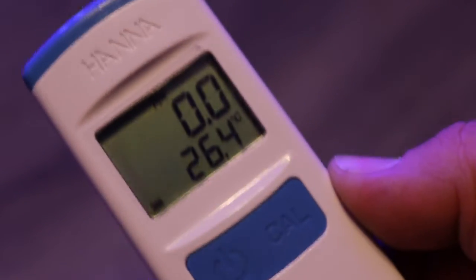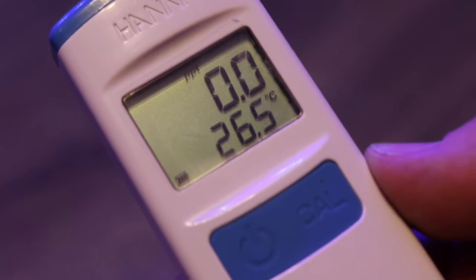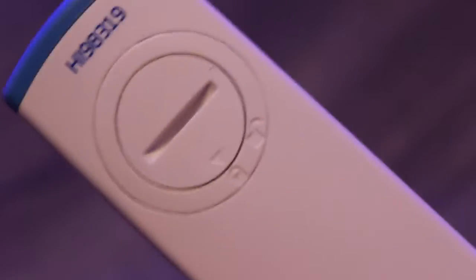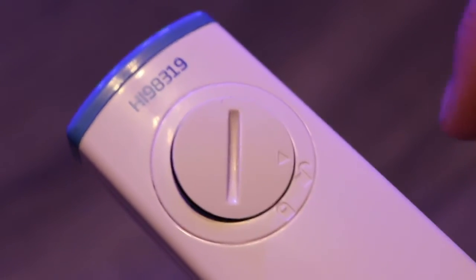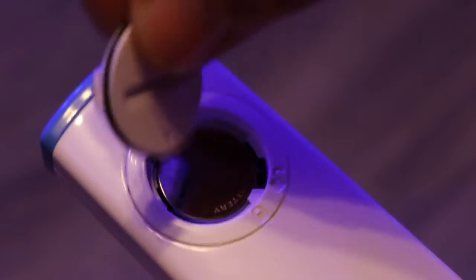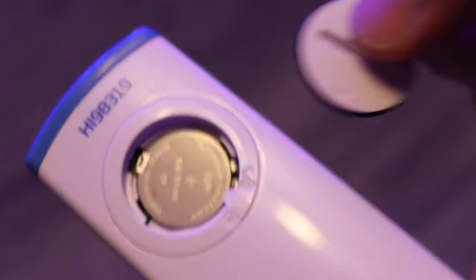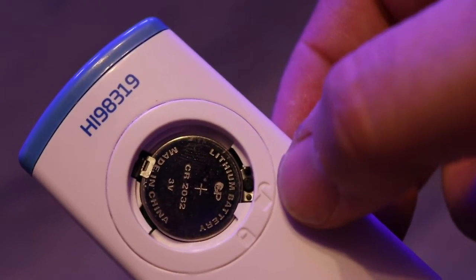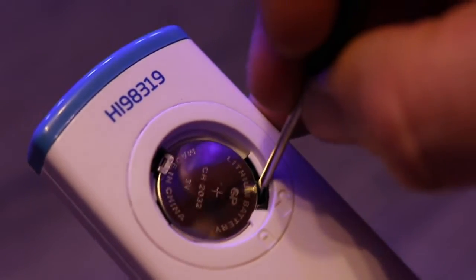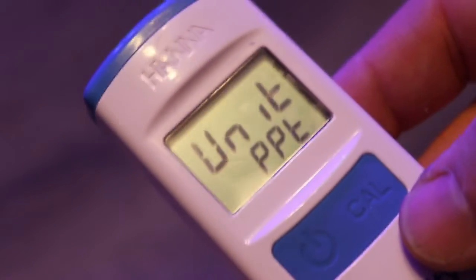Now we're going to look at changing the readouts on the Salinity Tester from parts per thousand in Celsius to specific gravity and Fahrenheit. Turn over the Salinity Tester and unlock the battery door compartment — it turns relatively rough due to the fact that it is sealed. When reinstalling the battery door, make sure it is flush and sealed, as improper reinstallation removes its waterproof properties. Press the little black button next to the unlock symbol — it's responsive and you'll hear and feel it click.